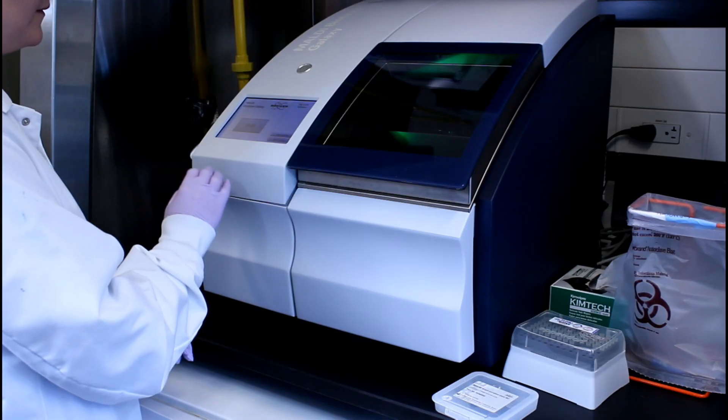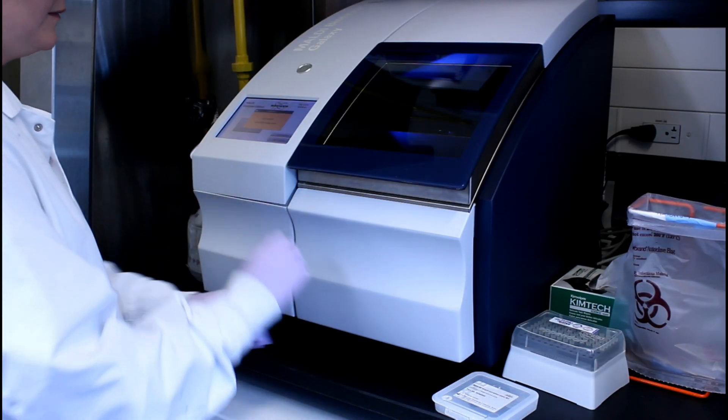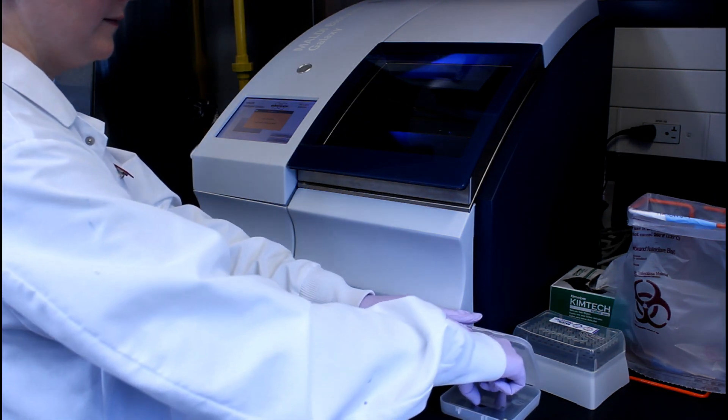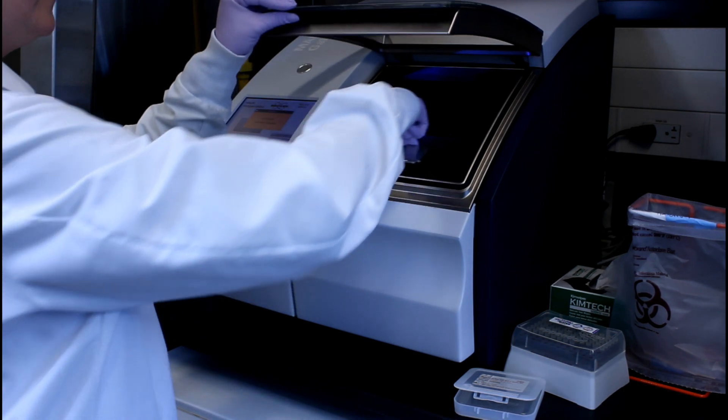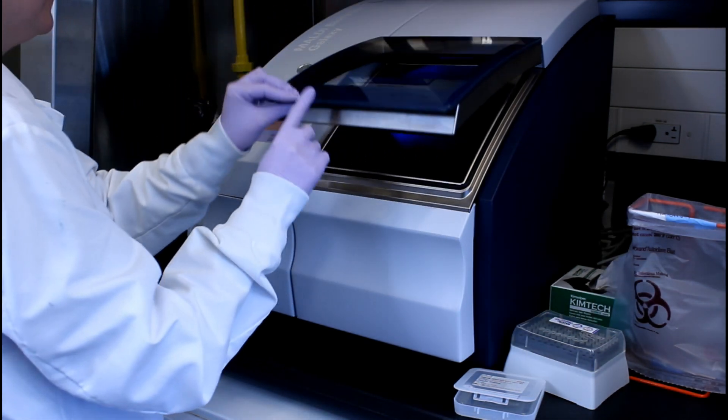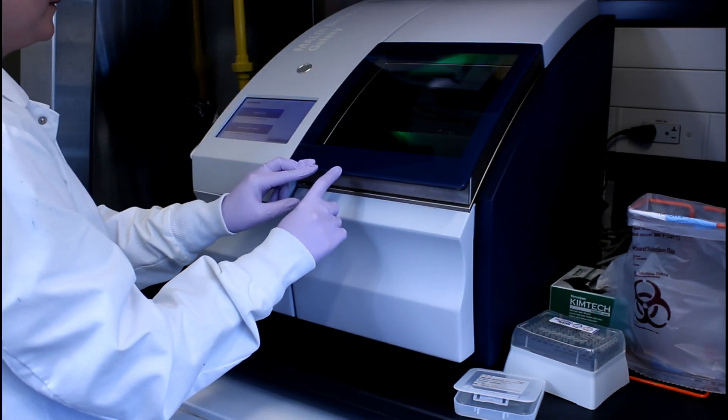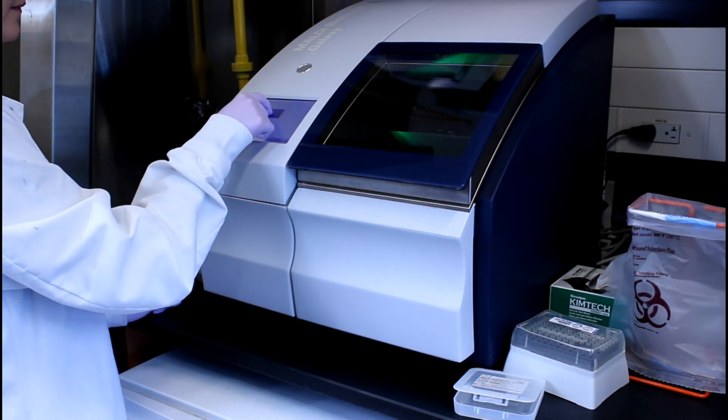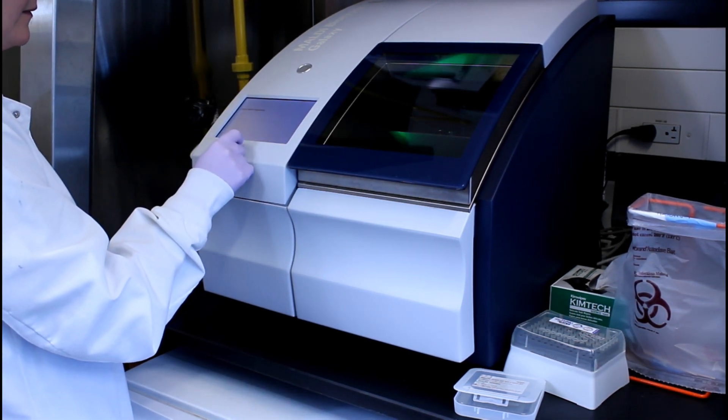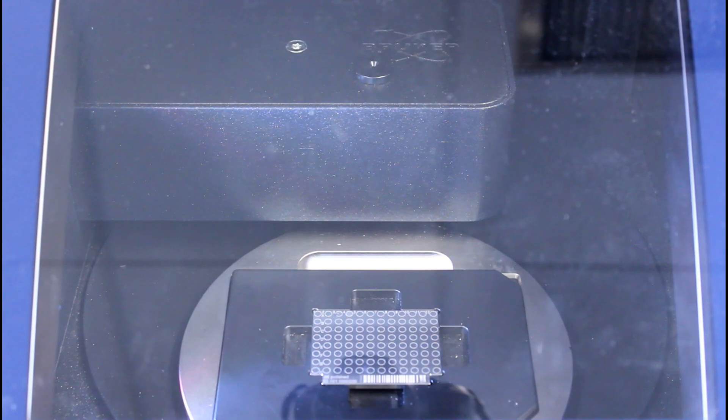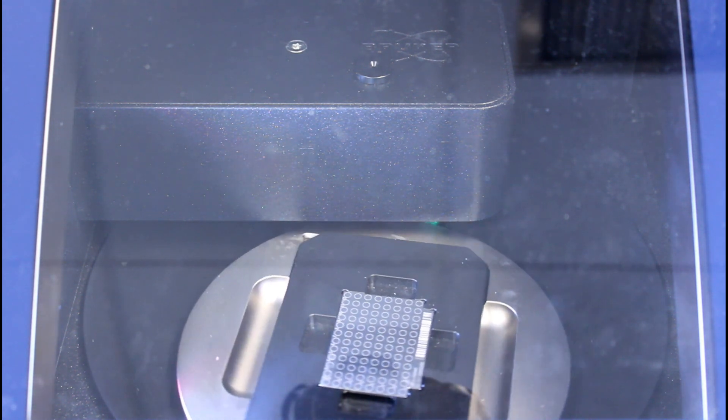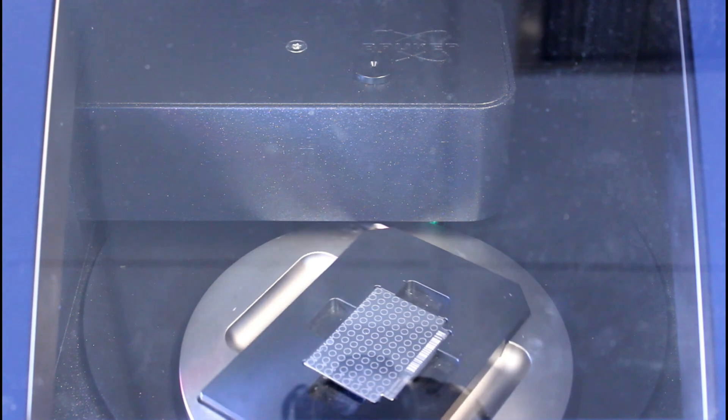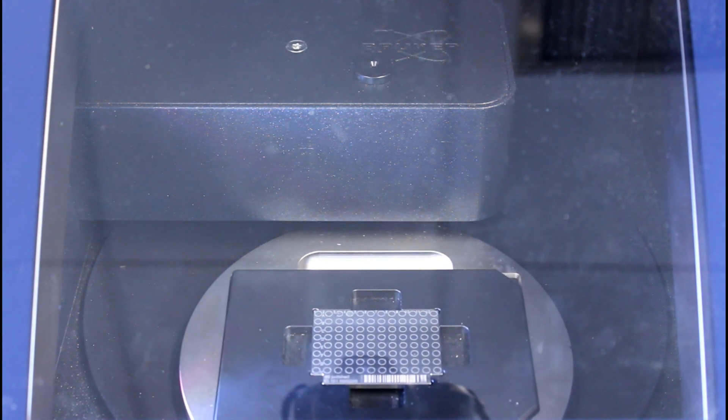You'll get an interim report as soon as we have an ID, growth, etc., but note that this will take a minimum of 24 hours from the time that the sample got to the lab. Timing will be extended if it's not a pure culture. The better the sampling technique and handling procedures, the better chance to get a pure culture. Mixed cultures will need to be replated and examined another 24 hours later. Antimicrobial sensitivity takes another 24 hours after identification.